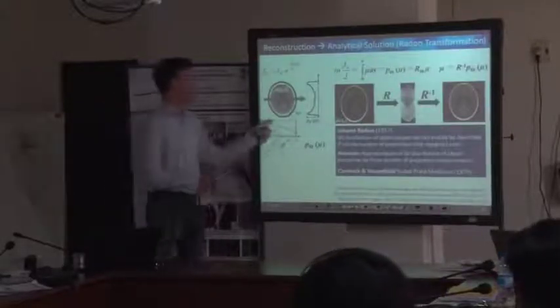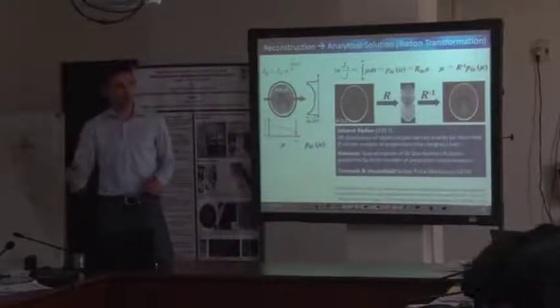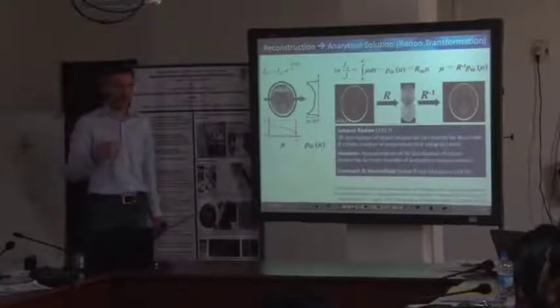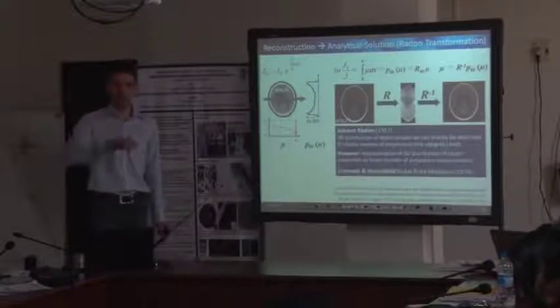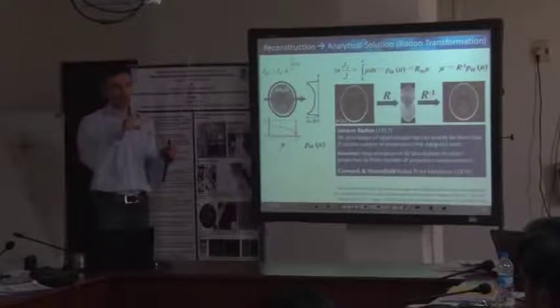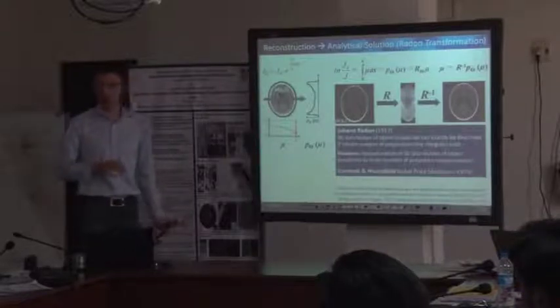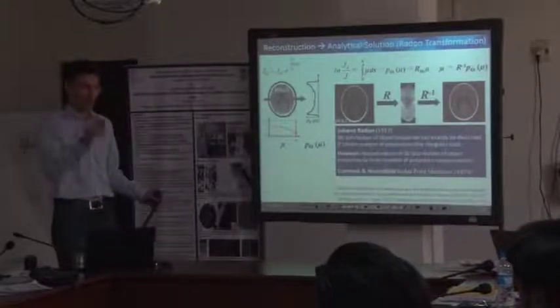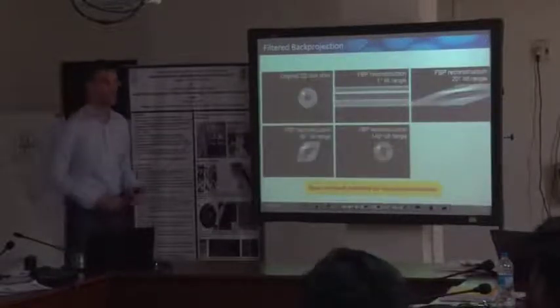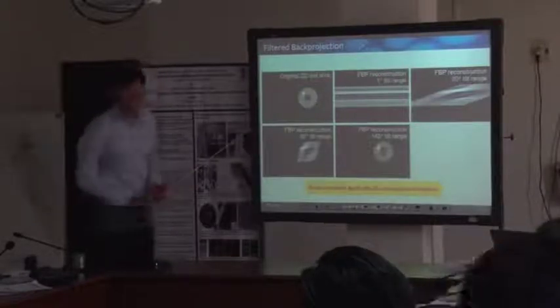imagine that the bigger the sample is, if you tilt to large angles, your contrast might go down or it might increase. But this doesn't necessarily have to be related to a change, because for instance with STEM intensity, it's not perfectly linear with respect to your sample thickness. So meaning that with increasing sample thickness, you might want to weigh your images for the back projection. So you don't use all of them as they are, but you multiply those using a certain factor, for instance. So this is a so-called filtered back projection.